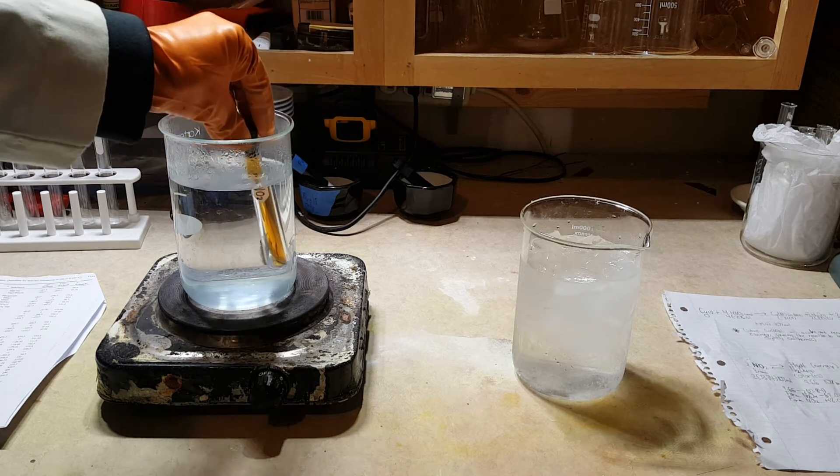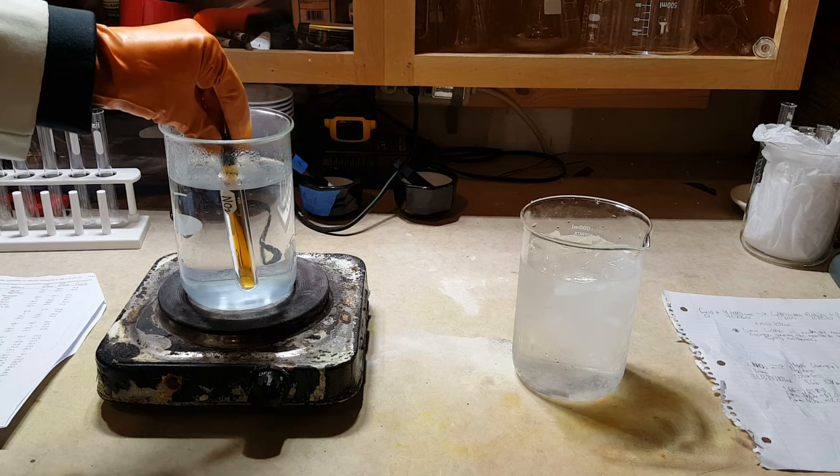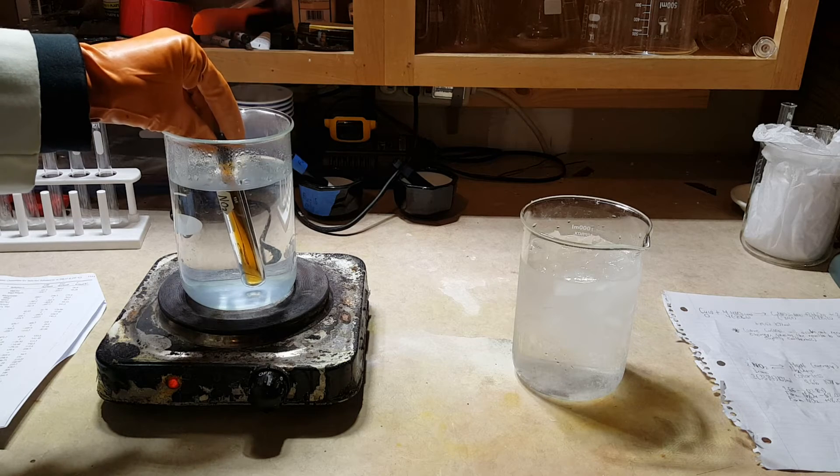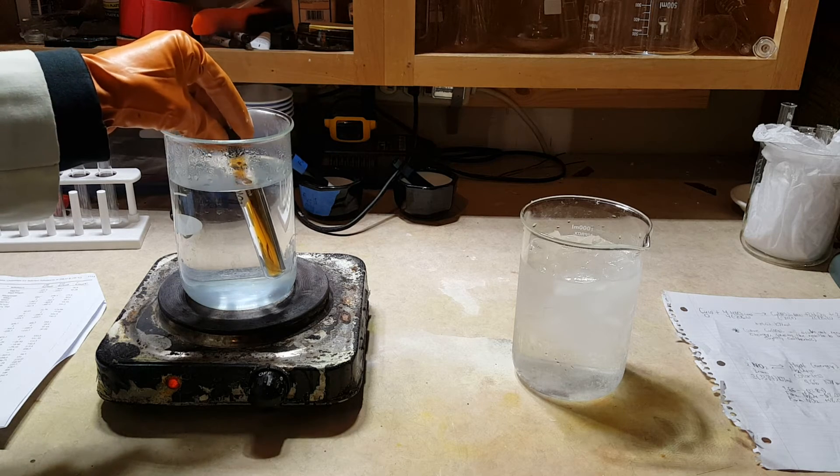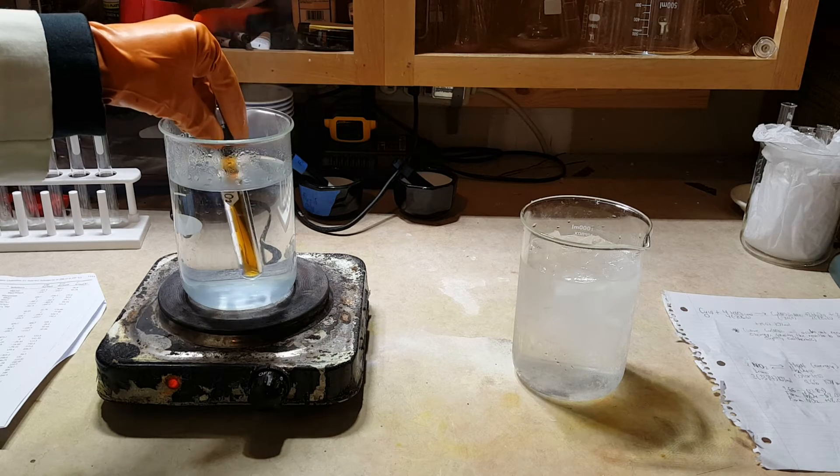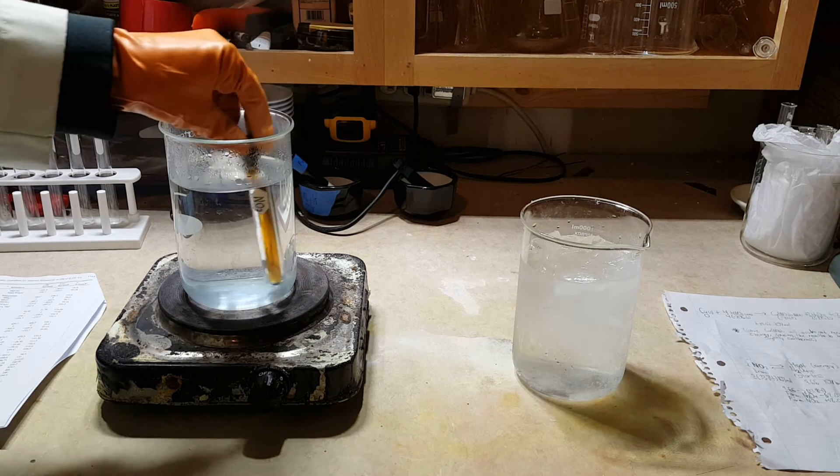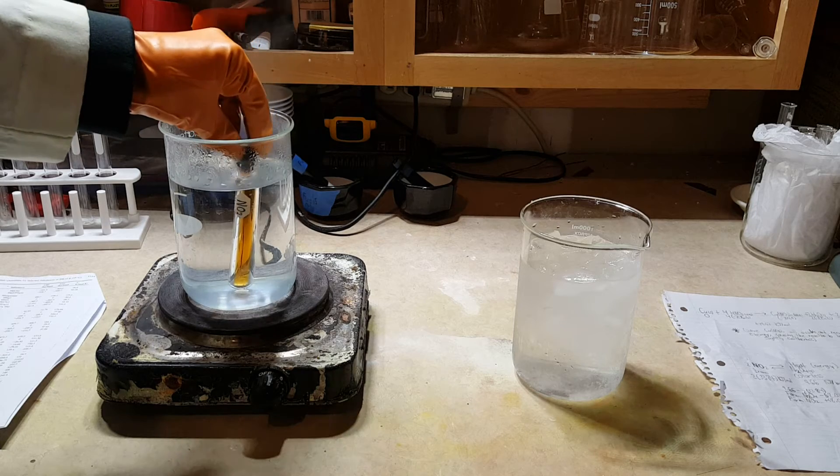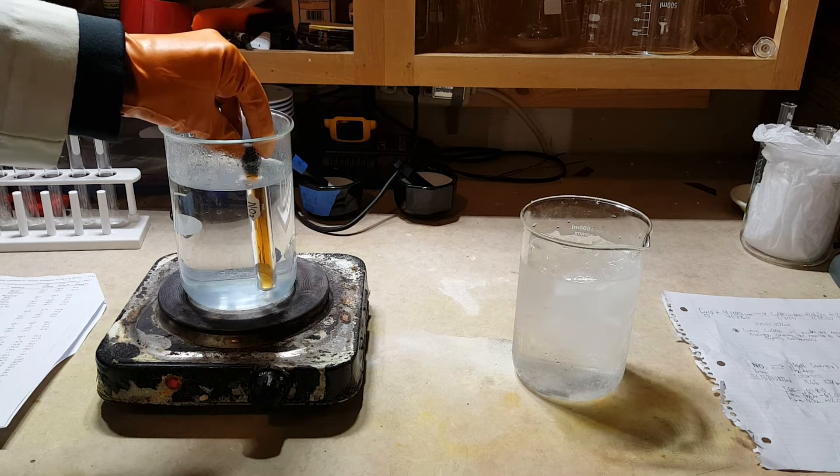So as you can see, our equilibrium is very quickly shifting towards our nitrogen dioxide. This is because we've added enough energy to break apart our dinitrogen tetraoxide. So that just forms two nitrogen dioxide molecules and turns our system a dark brown. So let me allow this to heat a little bit longer.